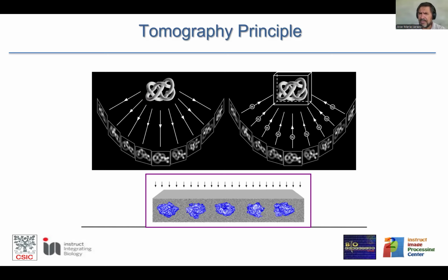So if they have a certain dynamics, a certain flexibility, we take minutes to prepare the sample. So of course, the macromolecule is going to explore its conformational landscape. And once you freeze it, it is frozen, and then it doesn't move.